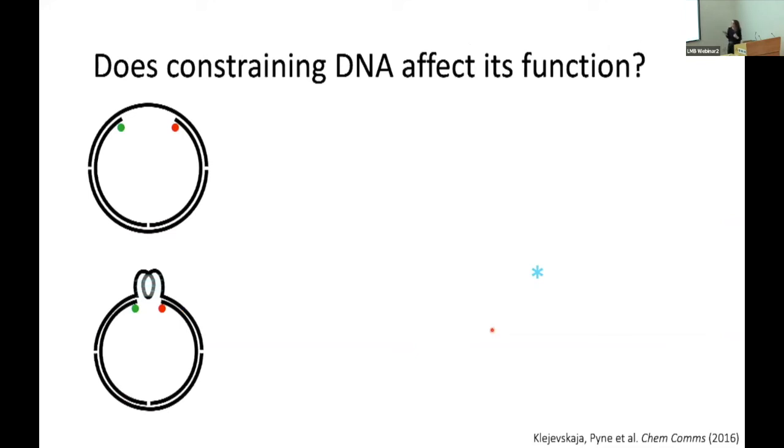To do that, I'm going to talk about G4 DNA, so fourfold DNA formed of G repeats that fold up into small G tracks. Lots of people are interested in them. They're overexpressed at oncogenes. What we did here, in this lovely paper with Ramon Villar's group at Imperial, was embed these into small circles of DNA. By putting small oligos of G4s into some level of bending constraint, did we affect the way they fold and unfold? Did we affect their dynamics or structure?